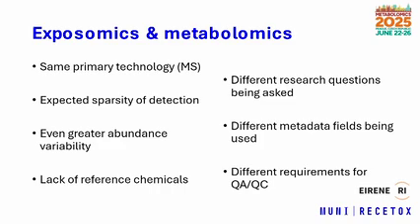Also, for environmental chemicals, there is a lack of reference chemicals, and so there is a lack of reference spectra. What I mean by this is we will never acquire the reference spectra for many chemicals, largely due to legislation where we cannot access them because they are proprietary products in industrial processes. Particularly within Europe, this is protected in legislation, so there will not be reference spectra for many analytes in the public domain at any point.